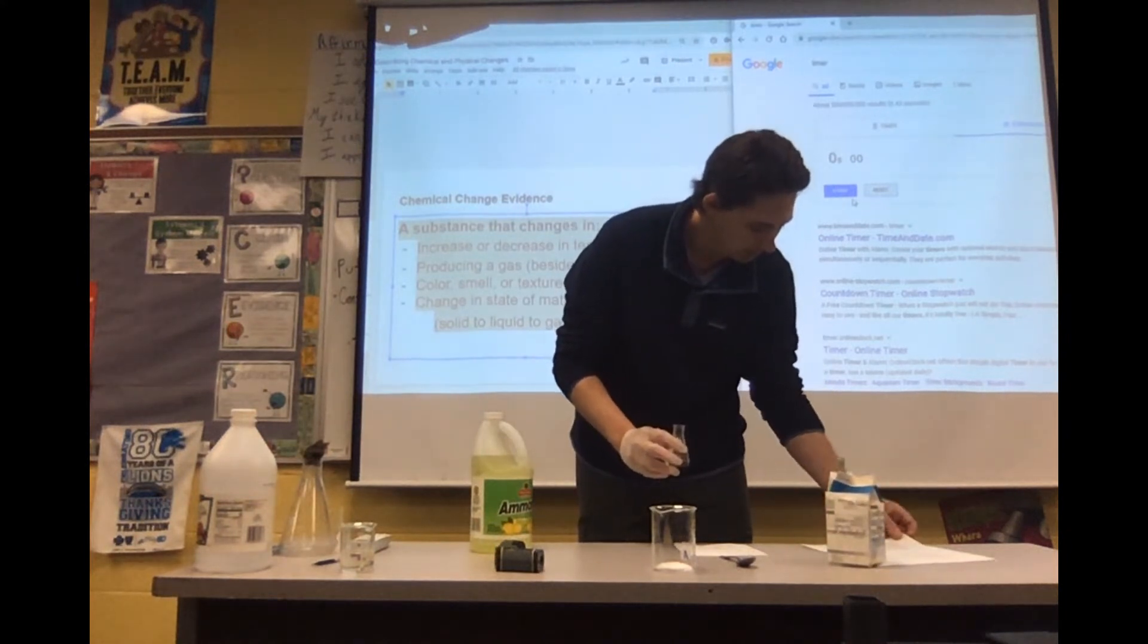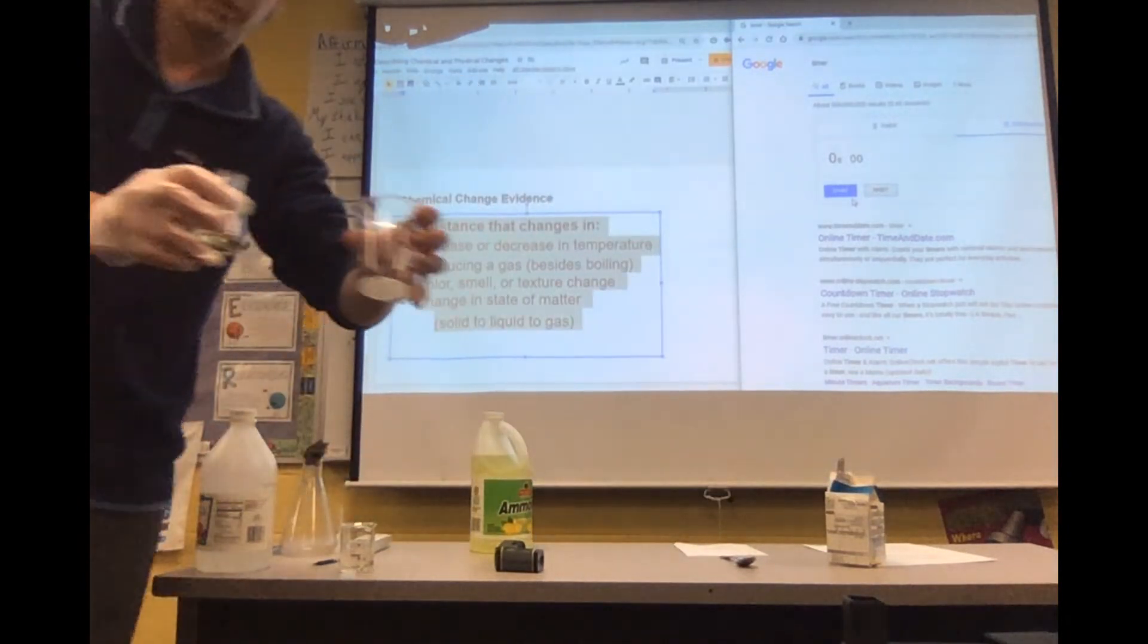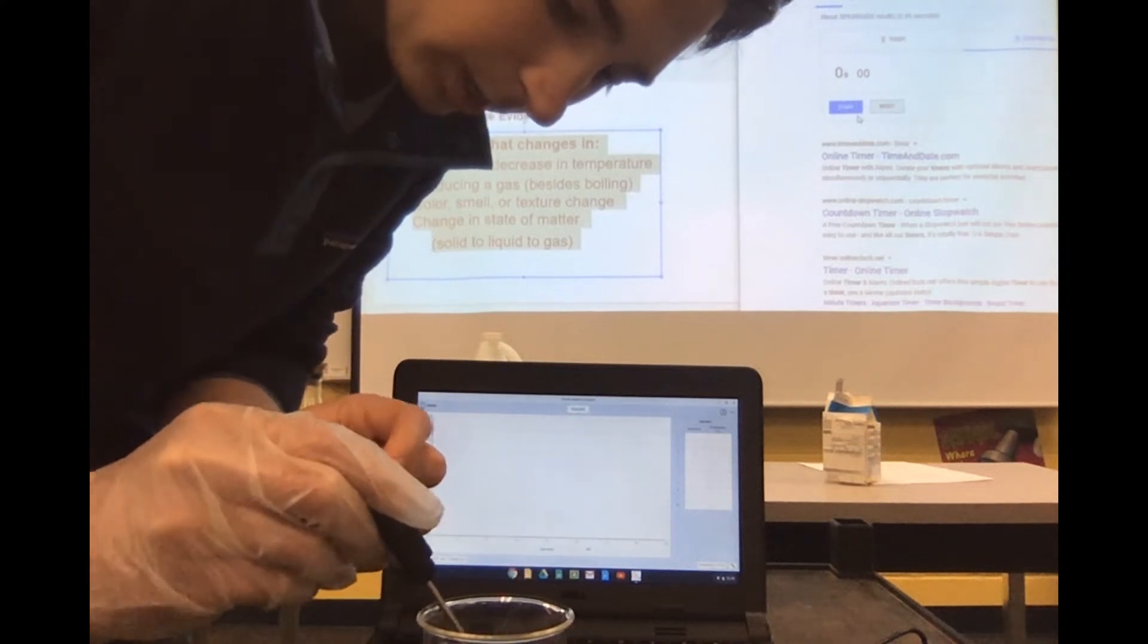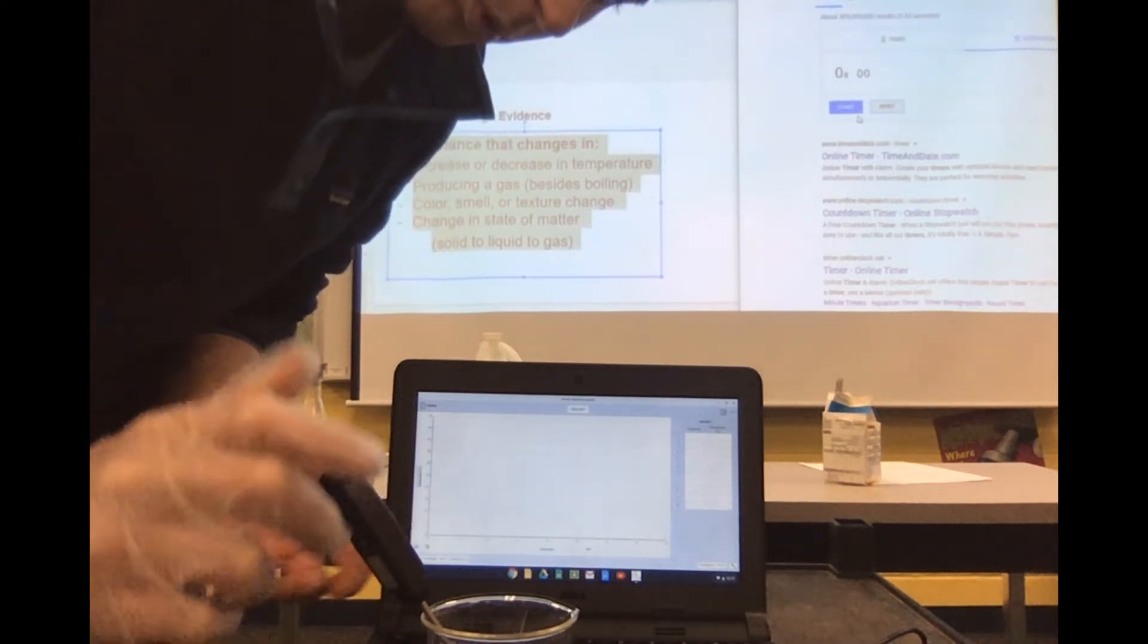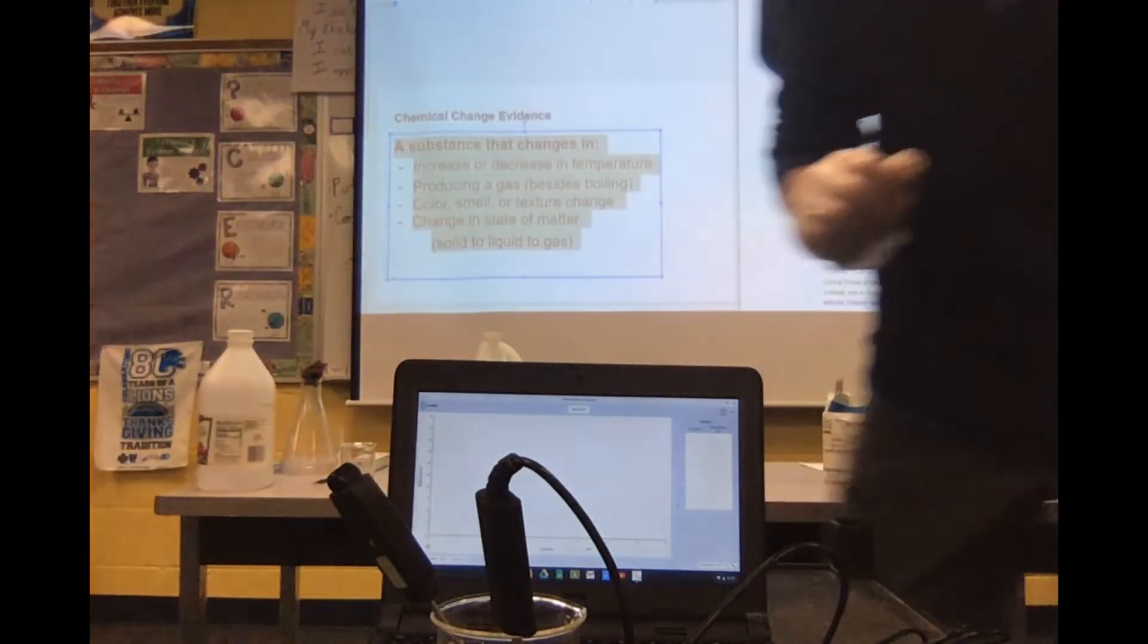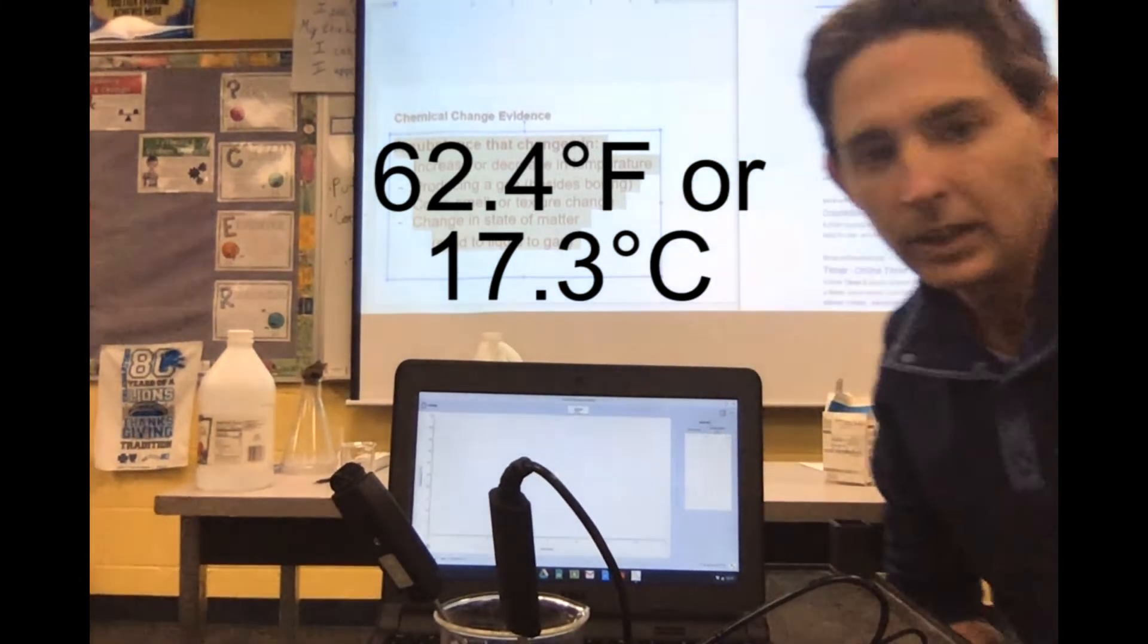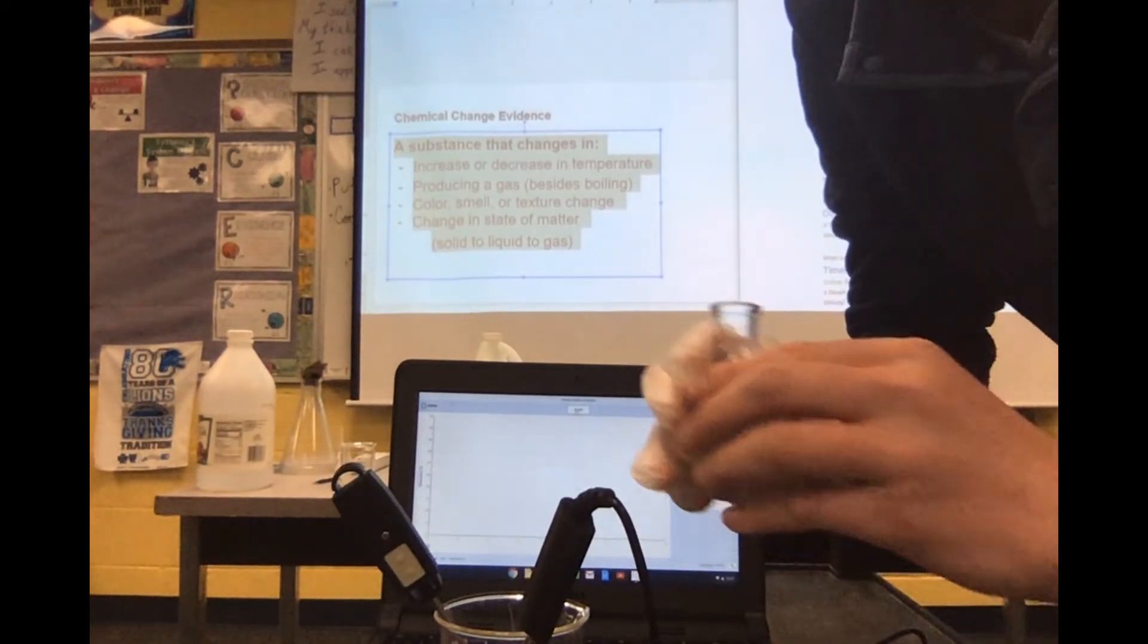Thermometer, a plastic spoon, and this little beaker here. Before I dump this, let's get our initial temperature and start the chemical reaction. My initial temperature for the ammonia, for the epsom salt is 62.4, and this initial temperature is 17.3. So I am going to go ahead and start collecting that and every two minutes I will come back and we will go from there.